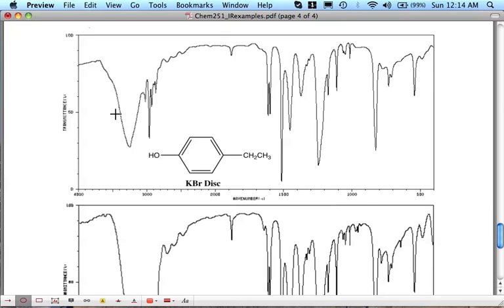It's right up here, right there, that big broad peak. It'll often look almost just like an OH for an alcohol. This one looks a little funkier, but it's definitely in that region around 3,300. What about these guys here? Did you characterize those as your normal CHs right there? And then look at this little guy. That's the one that's above 3,000. That's our sp2 CHs. So hopefully you got that guy picked out.